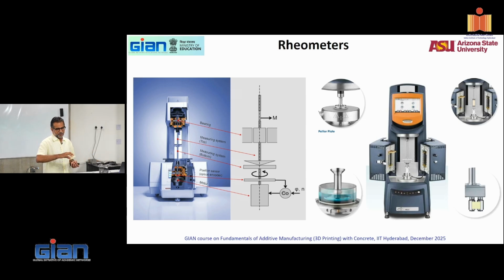At the end of the day, you have to have enough torque to be able to twist the material. And if it's a solid, you have to make sure that the torque you're applying is actually twisting the material as a whole and you're not capturing discrete atomic motions. But for lots of elastic solids, the large deformation range is not very obvious, so you really can't do that.